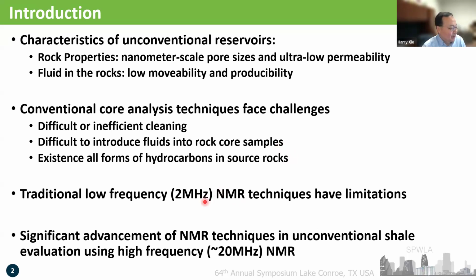So in the shale evaluation part, we use a so-called higher frequency, for example, 20 megahertz. Some people use 12 megahertz instead of 2 megahertz. We use 20, and in this work, we focus on using the higher frequency.